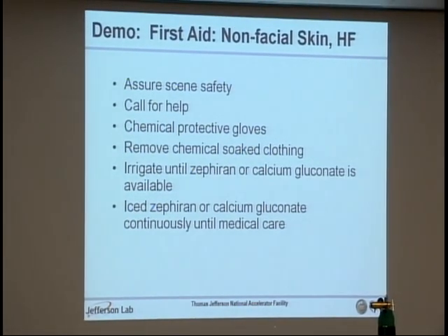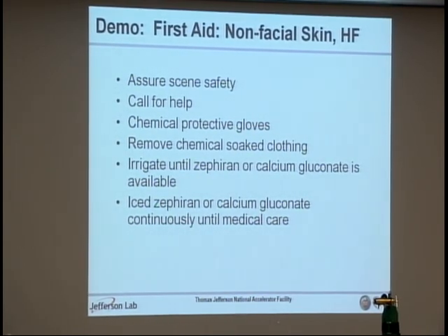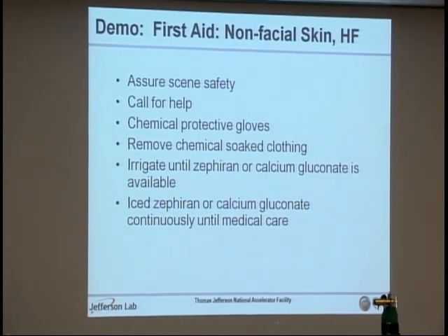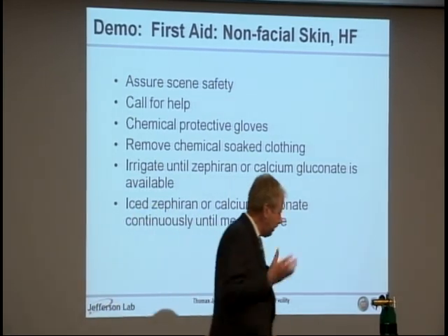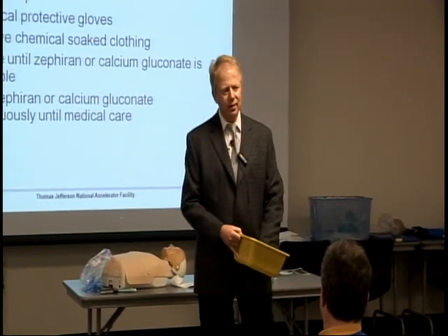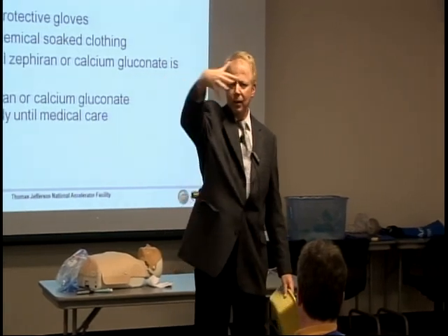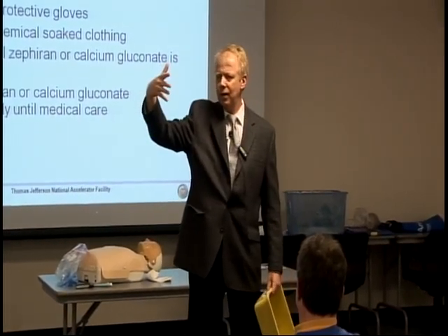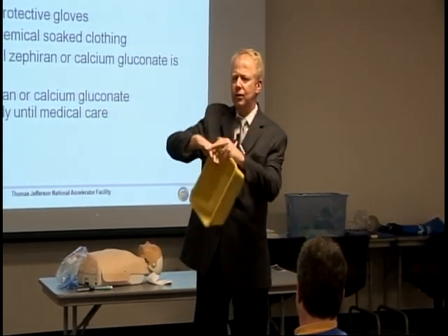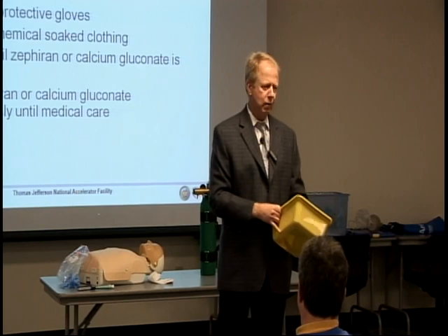If you're going to use Zephyrin, it's better if you ice it. Your Zephyrin is stored in the refrigerator in the camera rooms to keep it cool. You do either of those continuously until medical care arrives. For a hand exposure, Zephyrin is particularly nice because you can submerge the hand in a basin — that way you're not missing any crevice. The webbing between your fingers absorbs stuff really easily and is hard to access. A basin with iced Zephyrin is really good for hand exposures.